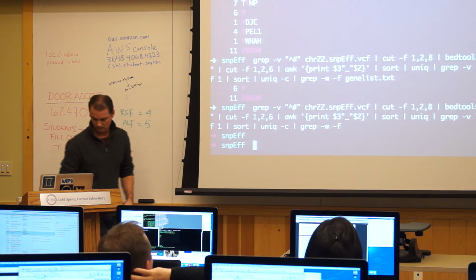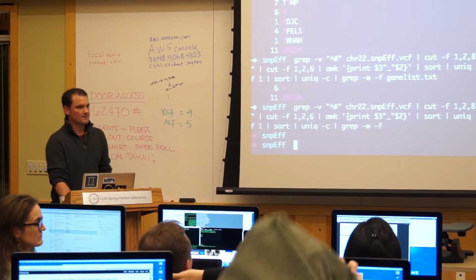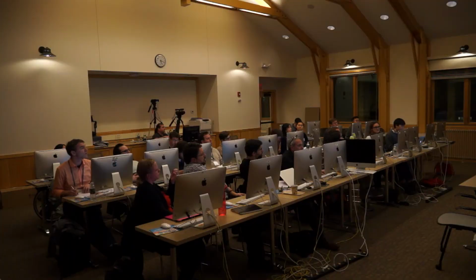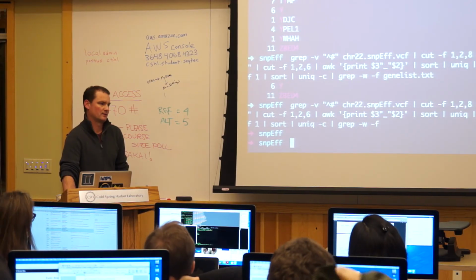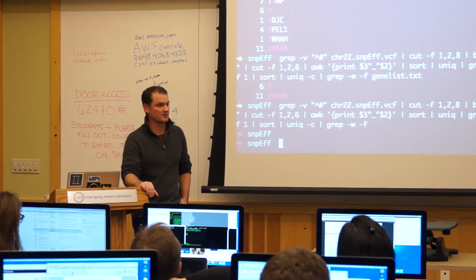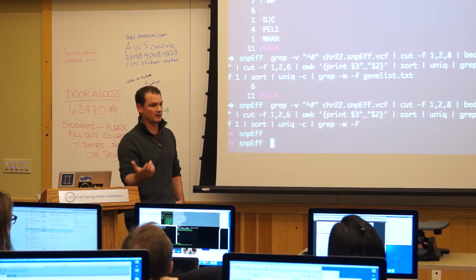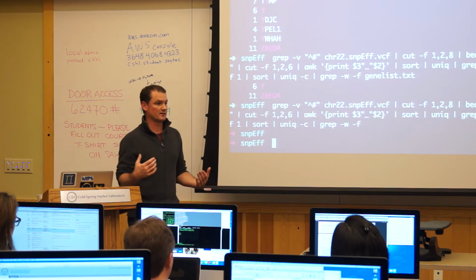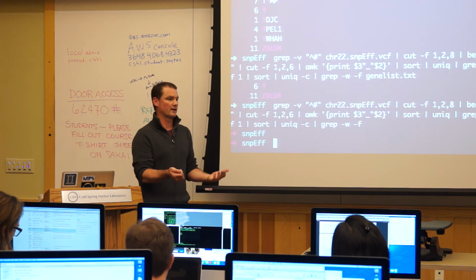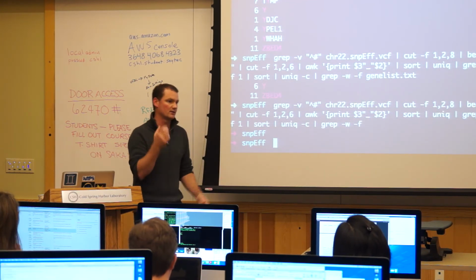How hard is it to generate a candidate list like that for an associated organ system or something like that? I guess it depends upon the function, the type. How broad the search is, because essentially you could use things like gene ontologies to just search for a specific cellular function and pull out genes that fall into it. There's plenty of tools online that will pull out all genes that fall into that particular function, but it really depends upon how granular and how specific you want to be, or how broad the search is.